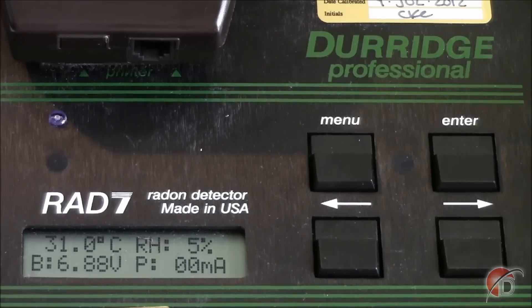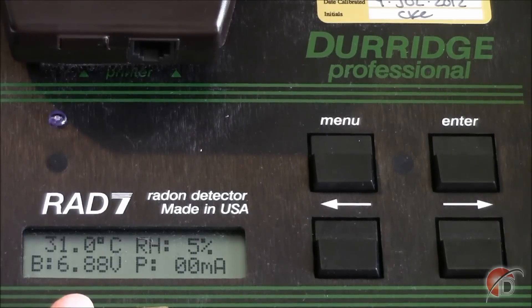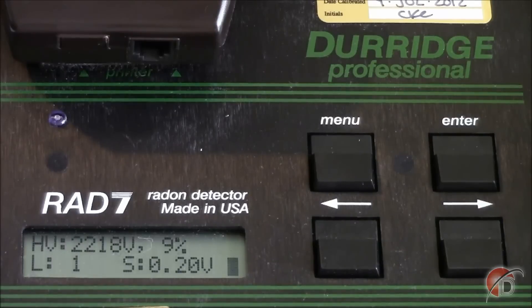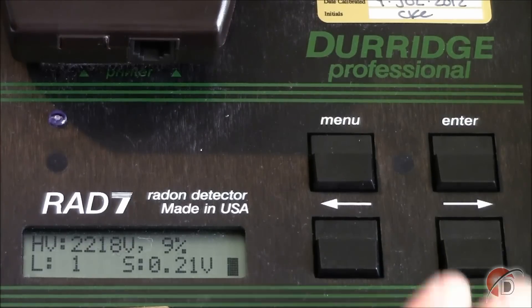The bottom left shows the battery voltage, which should range between 6 to 7.1 volts, and the lower right shows the pump current. A pump current above 90 mA is considered a sign of trouble, suggesting that there is a blockage in the flow path, or your filter may be clogged. Pressing the right arrow again, we see a screen that displays diagnostic values for high voltage and duty cycle, leakage current, and signal voltage.